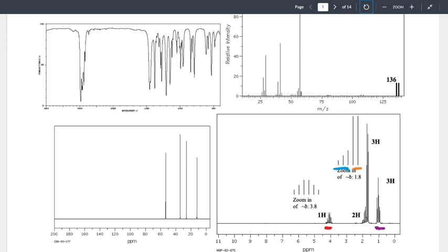Okay. Where does this hydrogen show up? Somewhere else. It's not the same as these, because that's a CH2 versus CH3. Where it's going to show up is about 1.3, I think. Don't stress about the details. So it's going to count that. Then it's going to see that one. Where's it going to count that? Same spot.